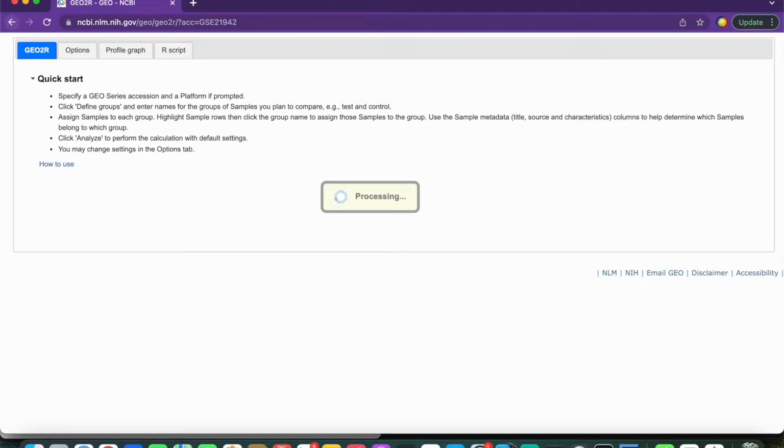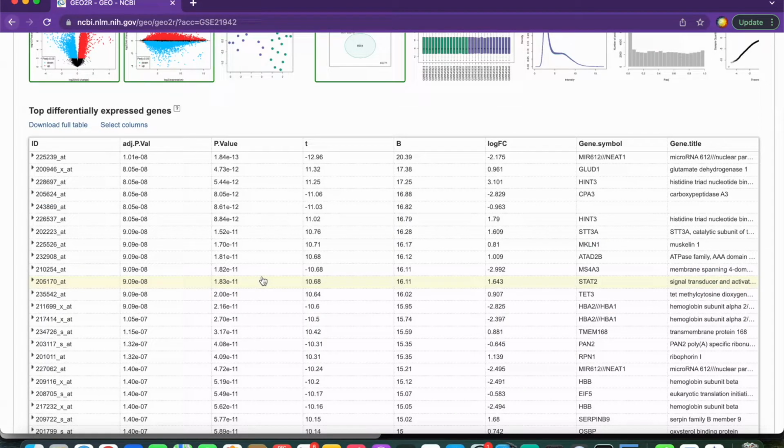Now, usually this takes a while, so as we wait for the magic to happen, I want to point out that the data that we get in this project is hyper-specific to MS. The genes we talk about here may not be important in other diseases. So if you are interested in using this method for another disease, do not just use whichever genes we find as significant, but use this entire method, because it's very important to see which genes are important for your specific project.